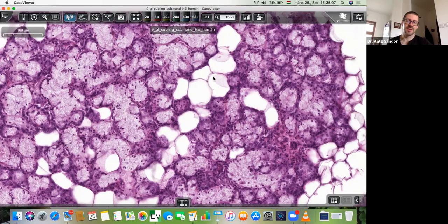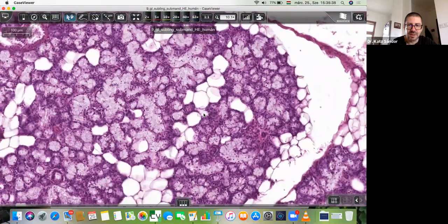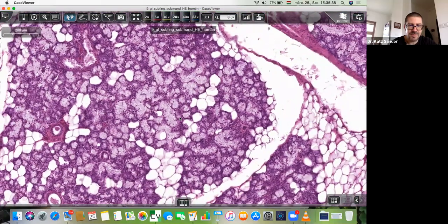And our next main salivary gland, the parotid gland, being the biggest gland, represents a large amount of adipocytes. It's really typical for the parotid. So, the sublingual gland is a mixed gland with predominance of the mucous acini. So here we have serous acini among the mucous acini and adipocytes. Eventually, the same duct system is presented.